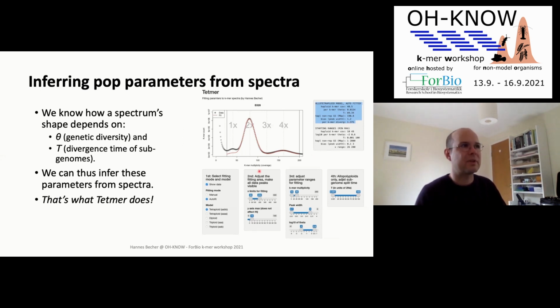And what I like about this is that it is interactive. So you don't have to submit a job and look what comes out of it, but you can interact with it. And if it does not do a very good job, you can just go back to the manual mode and you can put in parameters yourself and see what the K-mer spectrum looks like. And I think that's quite cool.